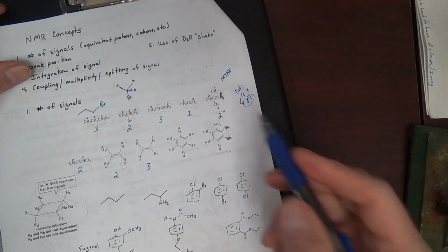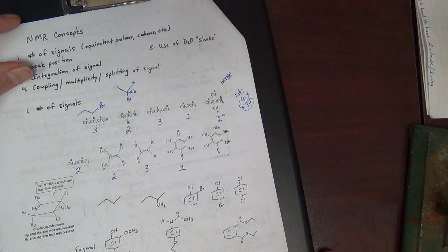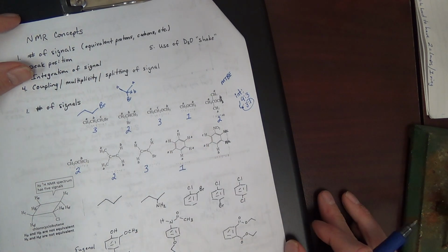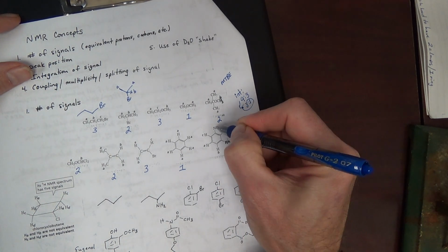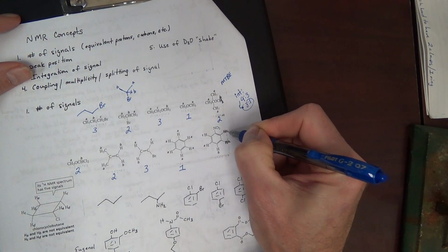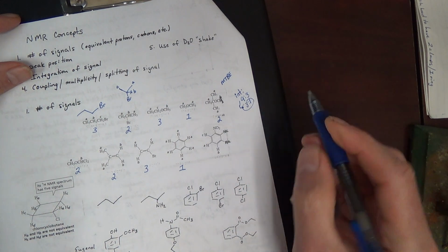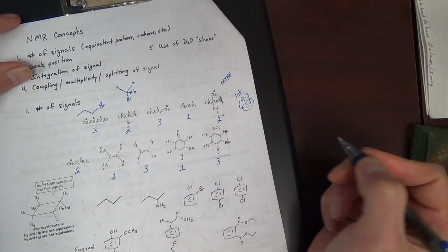Okay, a couple of aromatic compounds. This is benzene here, 1 signal. All 6 protons are the same. Hopefully that's pretty straightforward. But if we look at this compound in which we have a benzene ring with 1 substituent, with the remaining carbons being substituted with just hydrogen, we expect 3 signals.